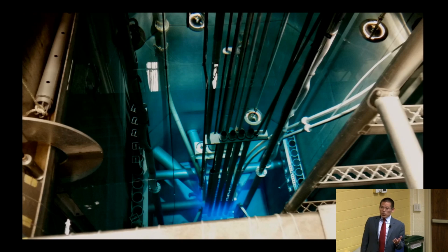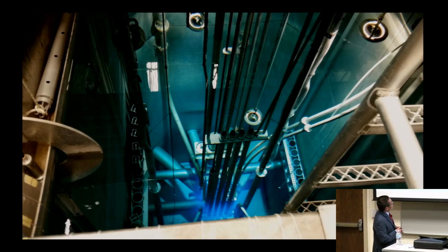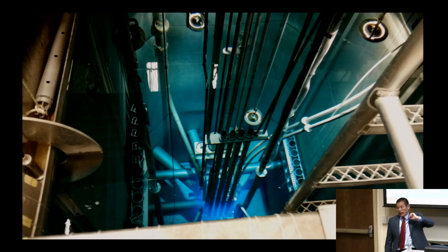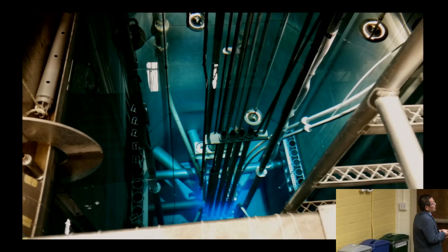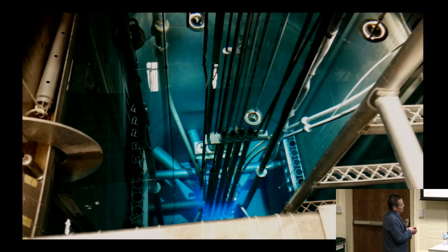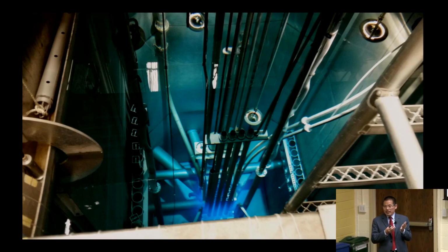The irradiation for neutron activation was done with the PULSTAR nuclear reactor at NC State. And you can see the Cherenkov radiation there. Our samples are put into these 4 tubes and go directly to this reactor and are irradiated. This is for the long-lived isotopes. For short-lived isotopes, there are 2 tubes here. Look here. It's kind of like the numbered system in a bank when you try to get some money. You put a sample there, it will shoot to the reactor, and after 30 seconds, you get it back. So that makes short-lived isotopes.